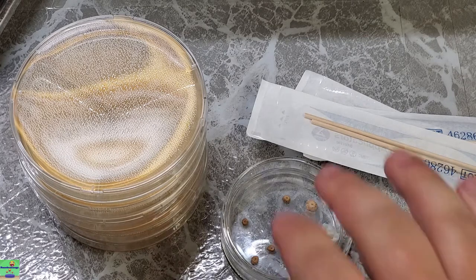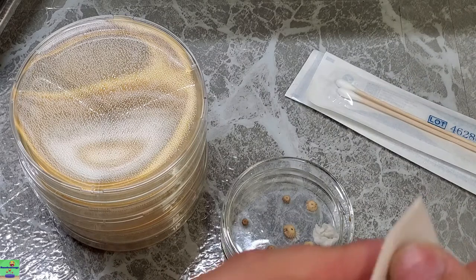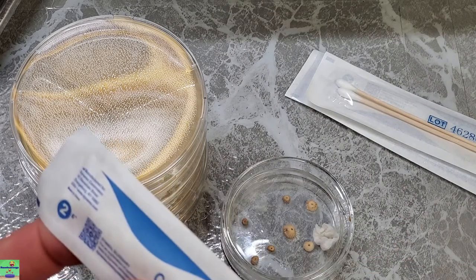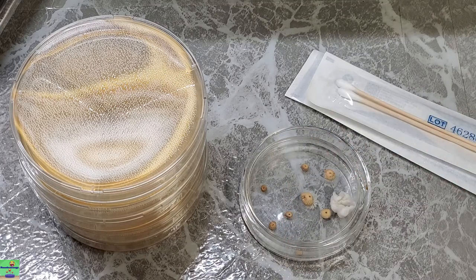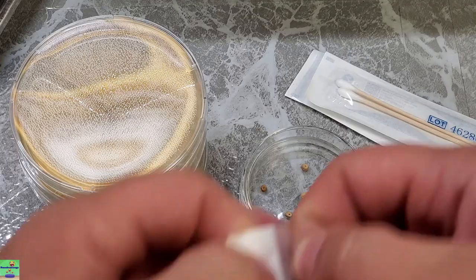Okay, so these are still covered up, right? You want to keep anything that you took a spore sample of, that you intend on transferring to agar or whatever medium you're going to propagate them onto, sealed off from the outside world as much as possible to avoid contamination. Remember, whenever it comes to mushrooms, avoiding contamination is absolutely everything.